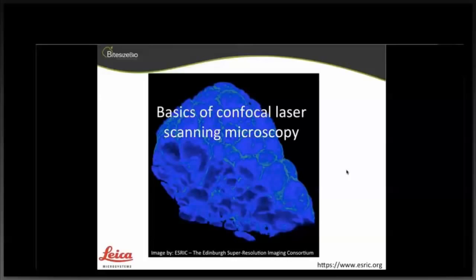And just to carry on with a few of the other questions, what is the speed difference between spinning disc and scan confocal? To be honest, I'm not sure. I've not used spinning disc very much personally. On a confocal, to take, say, a stack of a single mammalian cell, it would probably take you about 15 minutes at the proper sampling rate.